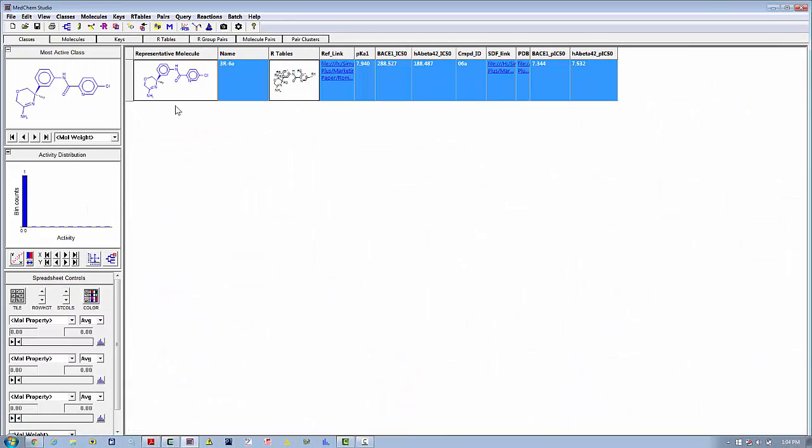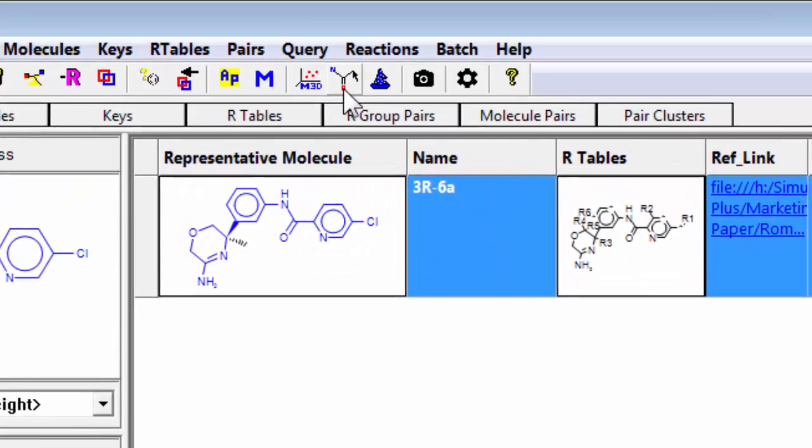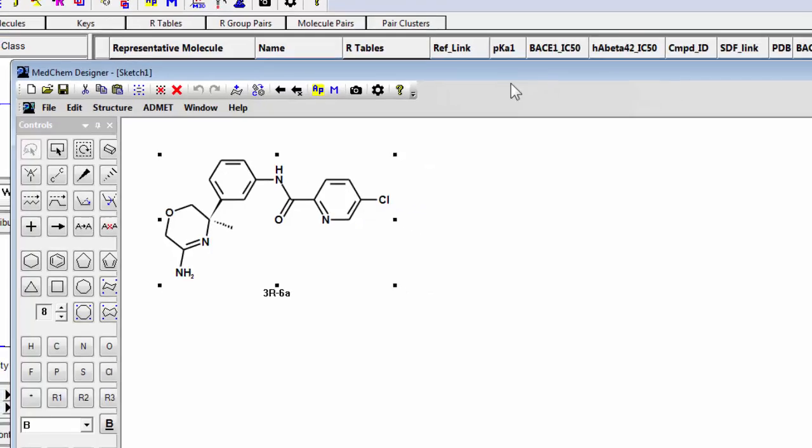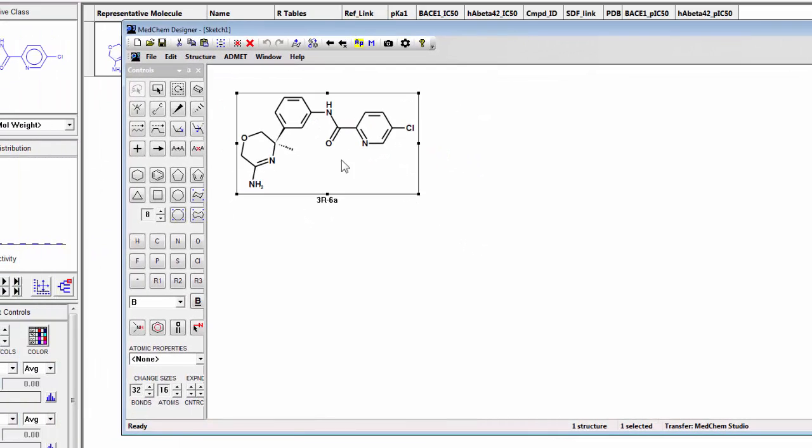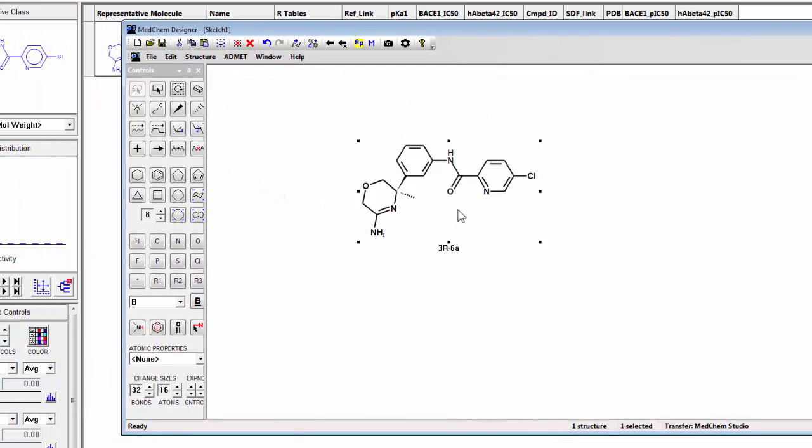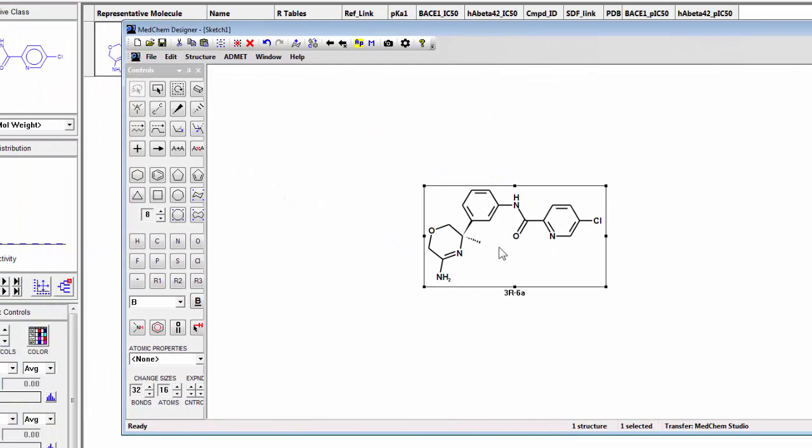Now that we've got a maximum common substructure defined, I'm going to take this compound here and take it into MedChem Designer and then orient it the way I want to.